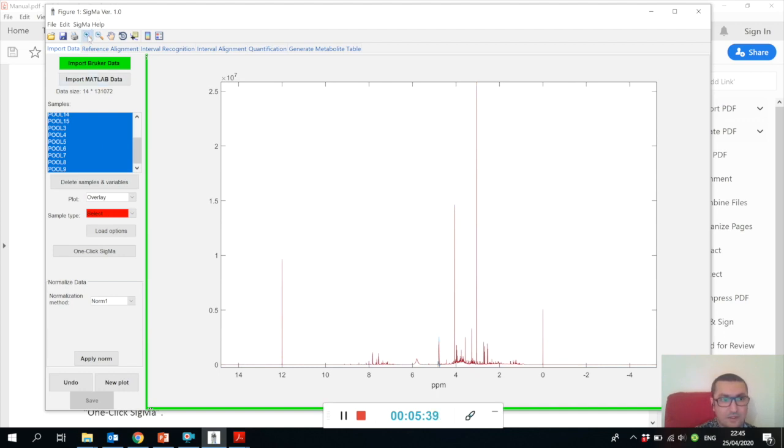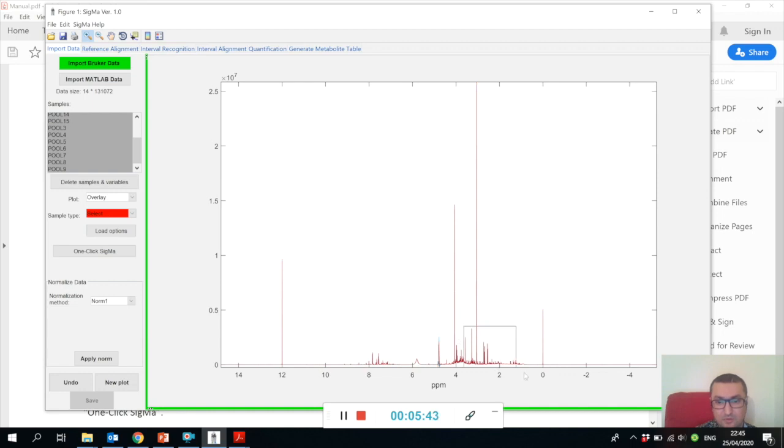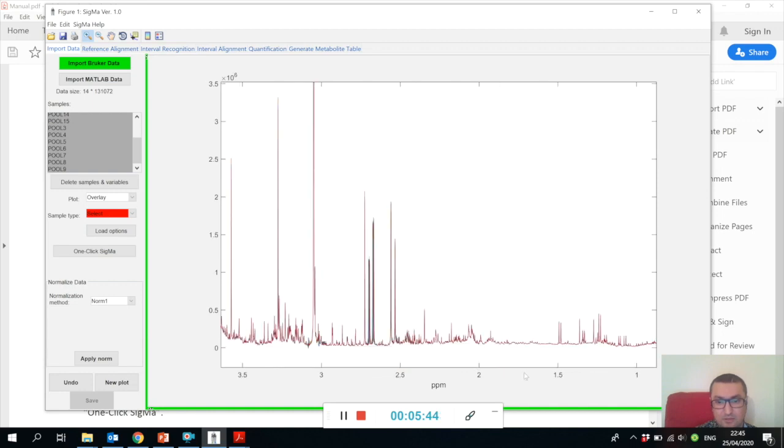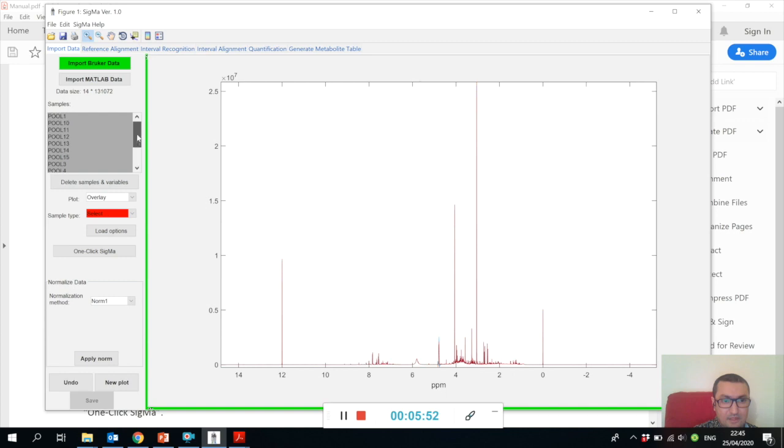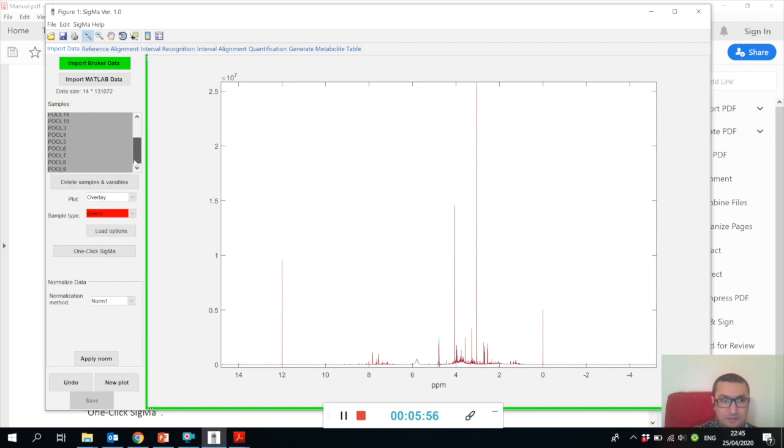You can use standard zooming options and try to zoom your spectra and have a look at different regions.